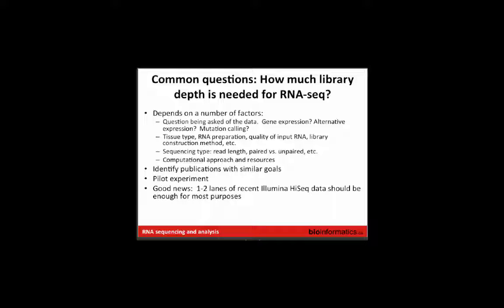One of the things that you'll see with heavily degraded RNA libraries, or libraries that come from FFPE material, is they tend to be much noisier. So you have a lot more reads that are in the introns, that are in intergenic space, that don't seem to have anything to do with transcription. But you are still getting signal from the transcripts, it's just buried in more noise. And so you can compensate to some degree by just producing more data.